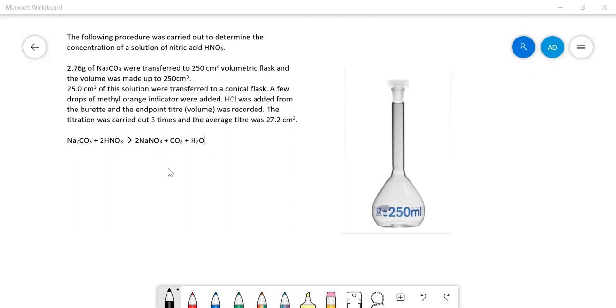Okay, so now we're going to do another titration. This one is definitely an A-level titration and this is how you would actually do this. The whole idea of this situation is we are going to determine the concentration of an unknown solution of nitric acid, and this is how you do it.